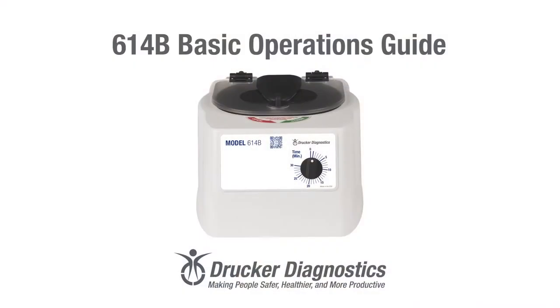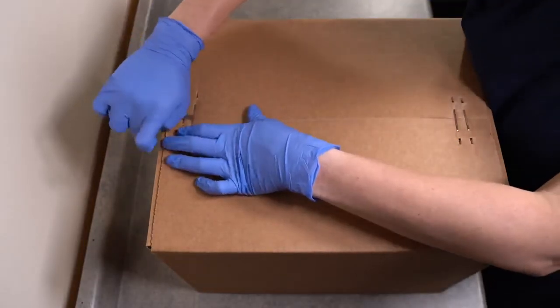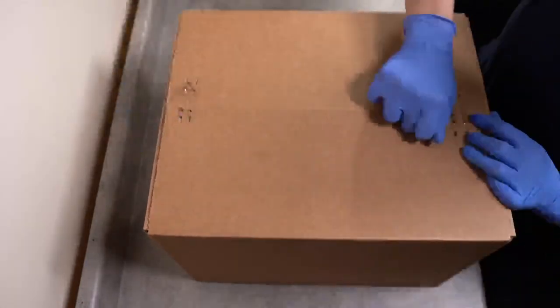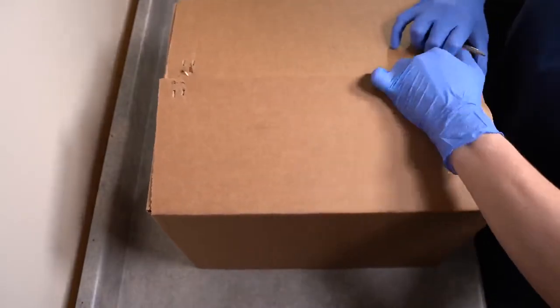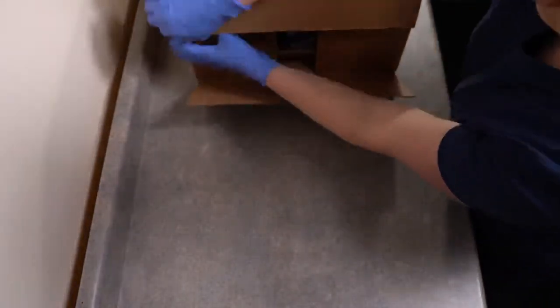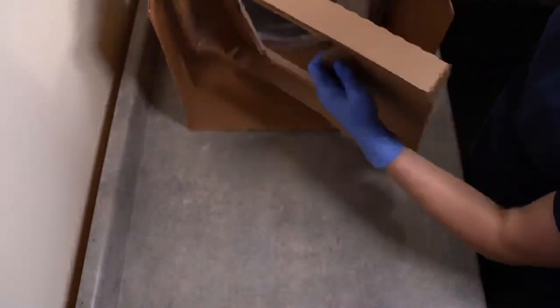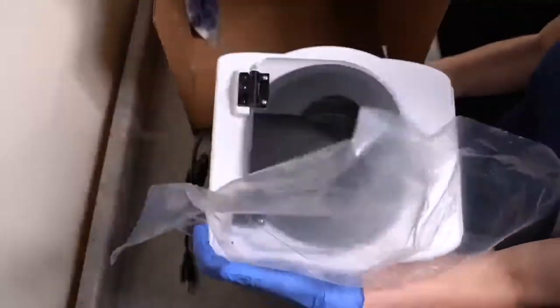Part 1 – Unboxing the 614B. To open your centrifuge box, you'll want a flathead screwdriver to remove the secure packaging. With your box open, you can slide the centrifuge out. Your centrifuge should come with a bagged accessories kit and with additional tube holders already in the rotor, but we'll cover all of this in detail later.